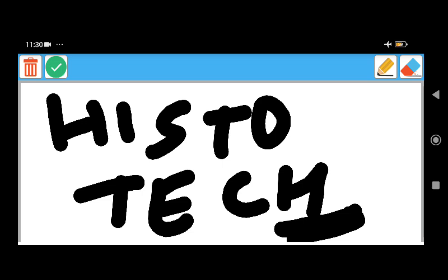Leuckhart's L-blocks are metal and simple in construction and use. They consist of two L-shaped pieces of metal, usually brass. By adjusting the L-blocks, the relative shape and size can be modified according to the size of the tissue. When the wax is set, the L-blocks are easily removed and are ready for further use.